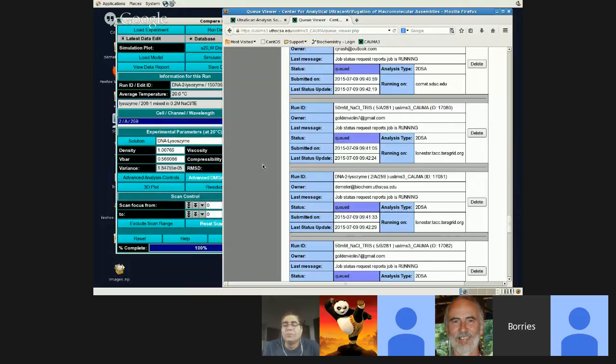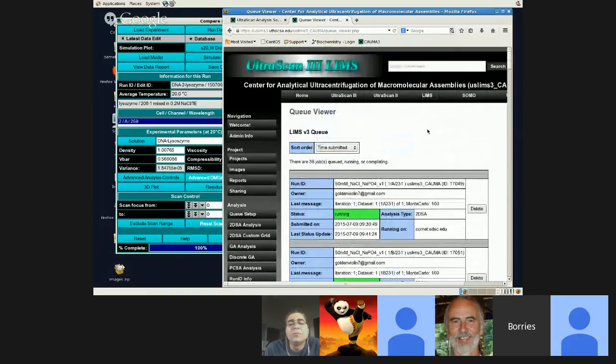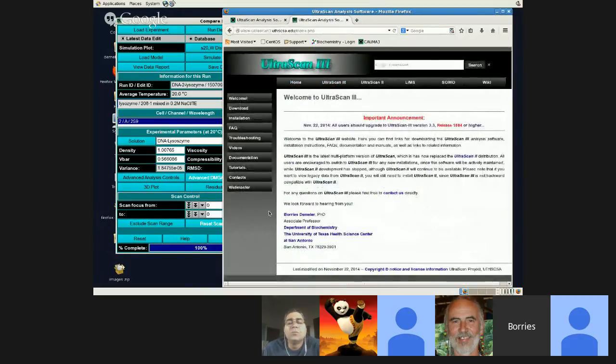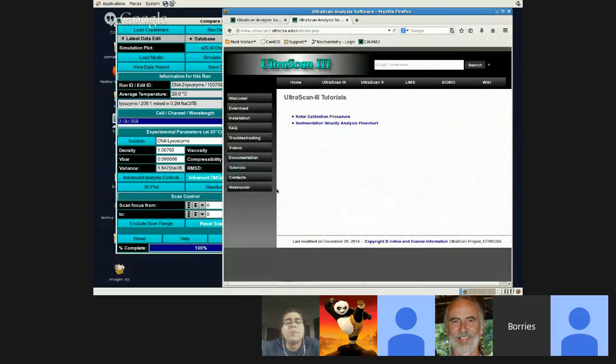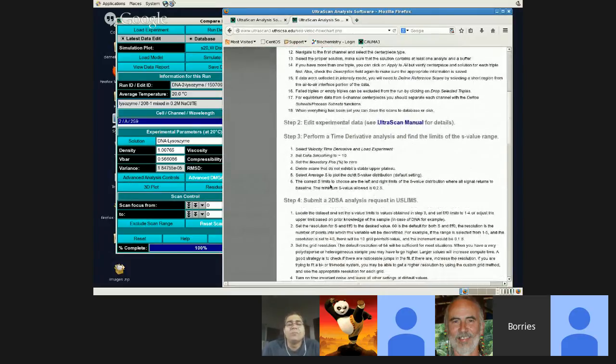One of the things I wanted to point out to you is another website here that may be helpful. If you go to home, I think UltraScan 3, let's see, there's some documentation here, or tutorials. I think you want to take a look at those. There's a sedimentation velocity analysis flowchart, and that basically has all the steps I'm going through documented.